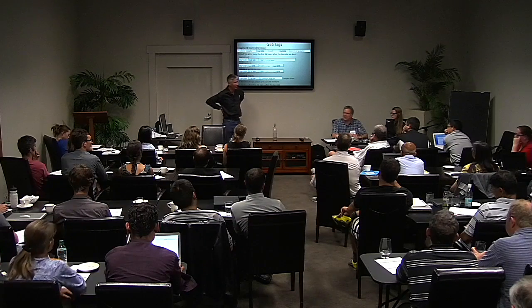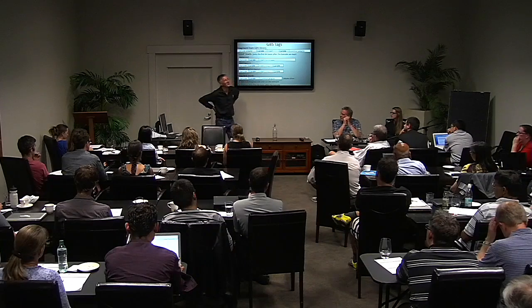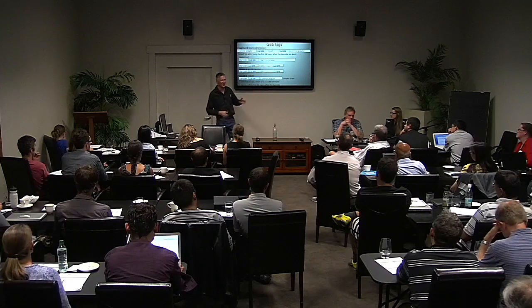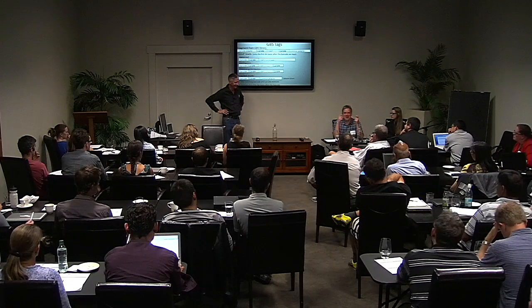Yeah, and we only limit this to 18 cycles. If it's a random event, it's gonna be filtered out anyway. That's the other thing. Katie says that a lot when she's talking about her work: does it matter? If it's random, it'll generate some tag that's only seen once or something, and it'll be filtered out. So I certainly haven't measured that.